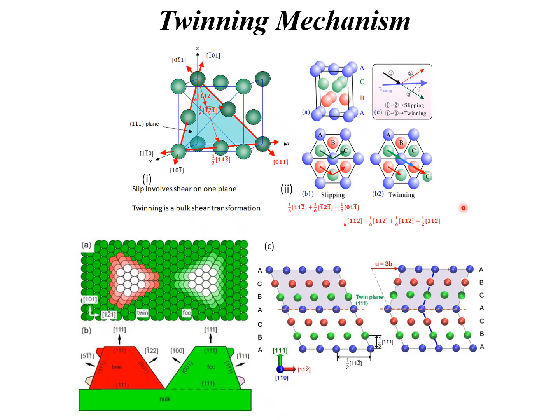And that's to be distinguished from slip, because slip typically involves a perfect dislocation, so you'll get one partial and then another partial, and a dislocation will move from this point to this point, which is a perfect lattice distance, whereas shear on each successive plane involves a partial movement, a partial shear on each plane, and because all the planes are shearing partially on each plane, they all basically are in register as one crystal, in this particular case with no faults, but there's a fault that exists at the shear plane, at the point of what we call the first undistorted plane.